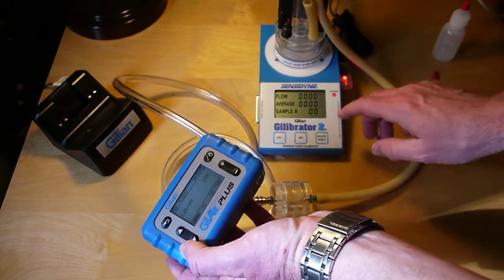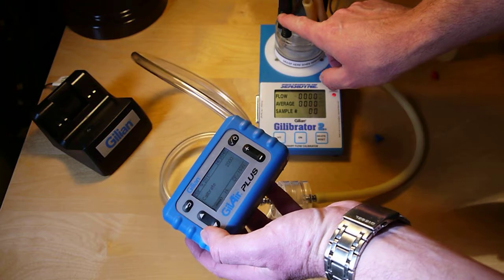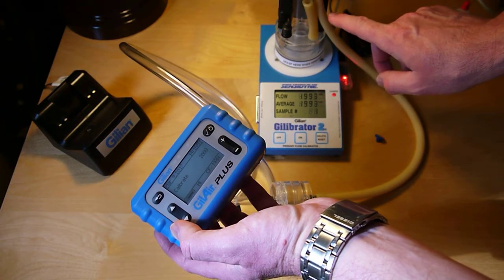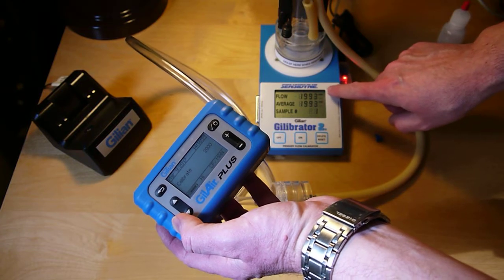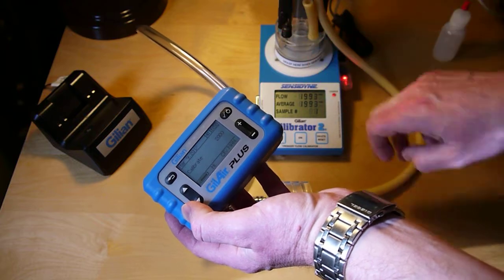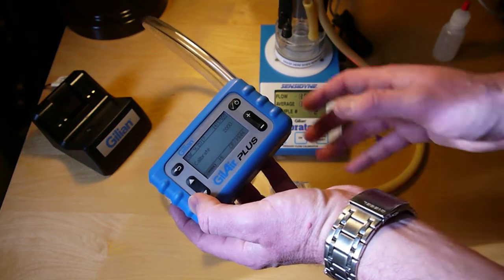The pump will start, and when I push this little button on the Gillibrator I'll get a soap bubble that comes up and you can see my measurement here. I may want to take a couple of these. Okay, so pretty close.